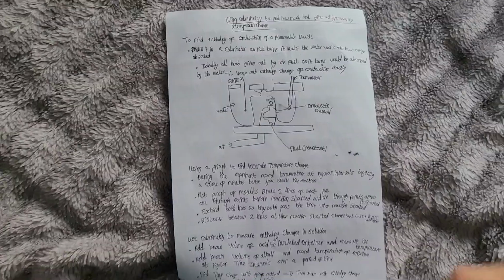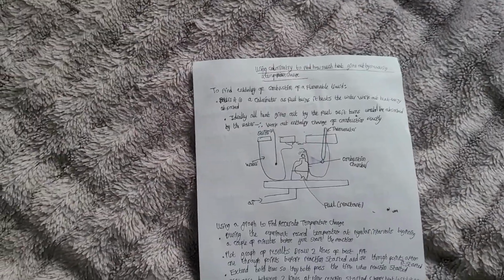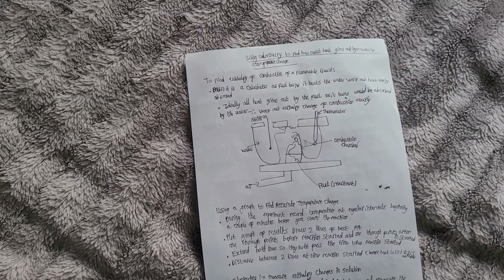Using calorimetry to find out how much heat is given out by measuring a temperature change. So, to find the enthalpy of combustion of a flammable liquid, burn it in a calorimeter. As the fuel burns, it heats the water. We work out the heat energy absorbed. Ideally, all the heat given out by the fuel as it burns would be absorbed by the water.